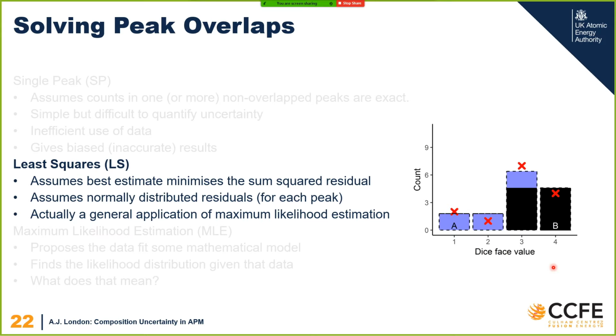It assumes, and this is key, that the error, the residual here on each of these, is normally distributed, which is not the case when you have count data. When you have count data, we can think of these bars as being Poisson distributed, and that's not normal. Your actual observed count can't go below 0. So it can't be normally distributed, because a normal distribution goes plus or minus infinity. So especially when you get to small counts, least squares is going to be worse.